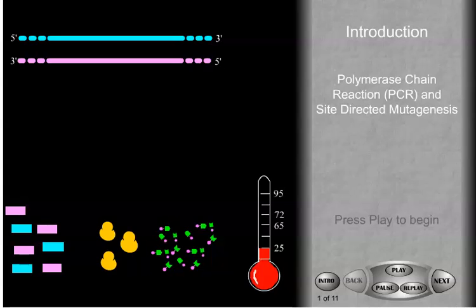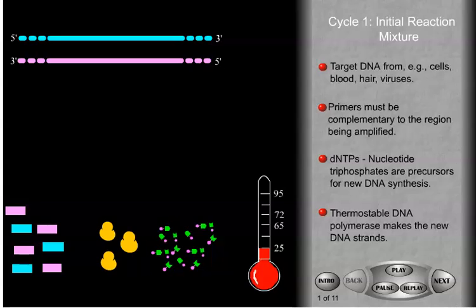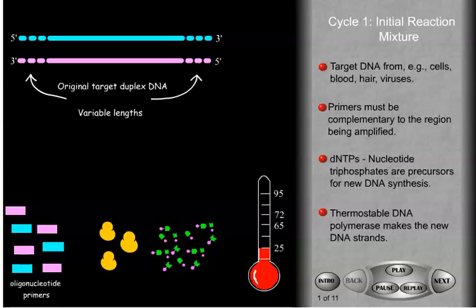A PCR reaction is typically carried out in a small tube placed in a machine called a thermocycler. The thermocycler simply changes the temperature to selected values for defined periods of time according to a program which you can repeat over and over again. The initial reaction mixture contains a target DNA, synthetic oligonucleotides corresponding to two sequences in the target, DNA polymerase, and a mixture of the 4 deoxyribonucleoside triphosphates.